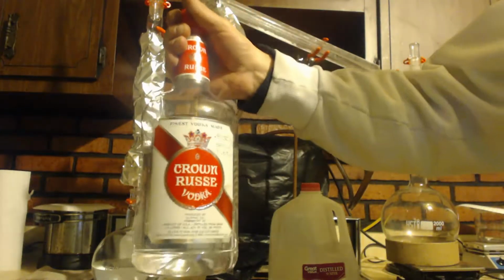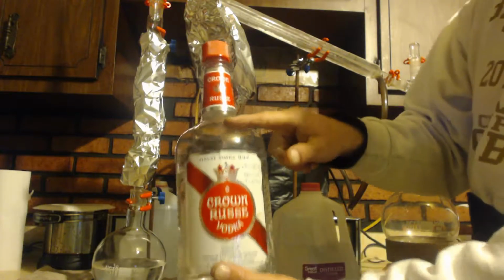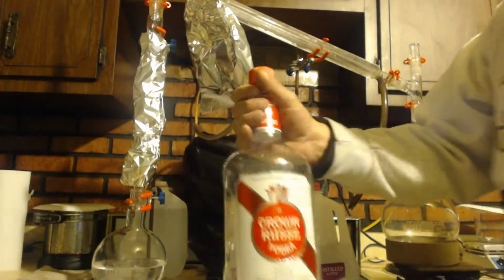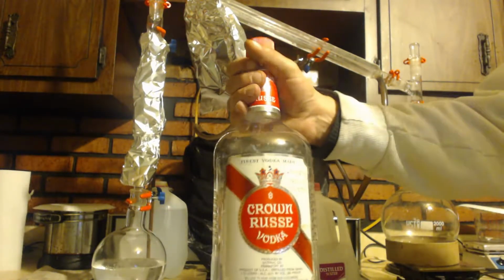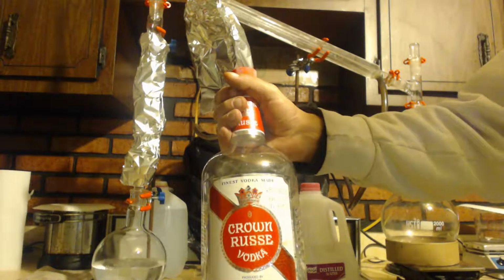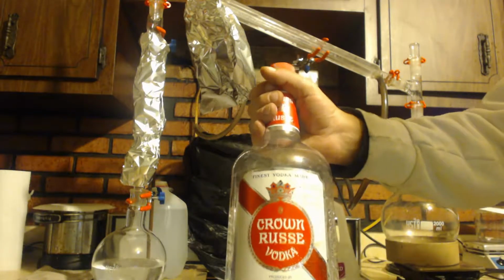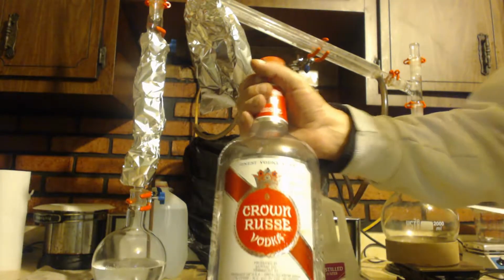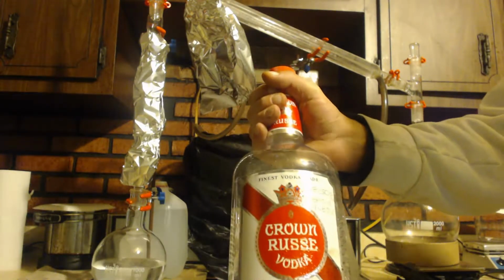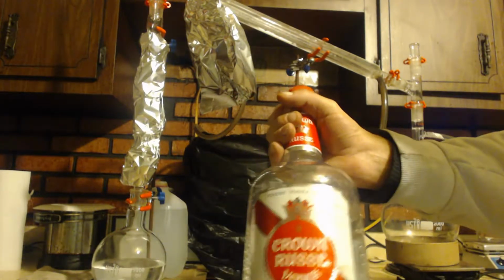Now, this bottle was a 1,750 milliliter bottle, but I only had to fill it up to about right here. So there's probably 100 milliliters there. So say I had 1,650 milliliters. I got a density of 0.8250. And that took that 40% by volume up to 91.8% by volume, which correlates to a mass percentage of 88.